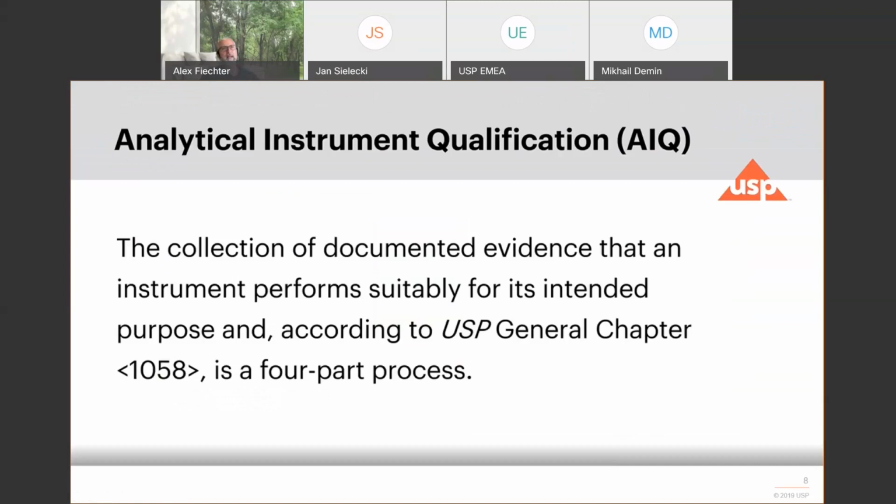They are not regulated, nor are they enforced by the FDA, or shouldn't be by any other competent authority. Everything below 1000, so in the case of the general chapter 711, this is a mandatory chapter. So if a monograph contains a dissolution procedure that calls for the dissolution test to be done according to 711, it's a request to do that.